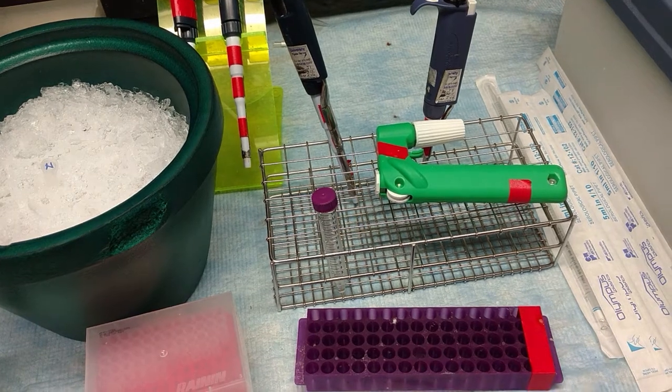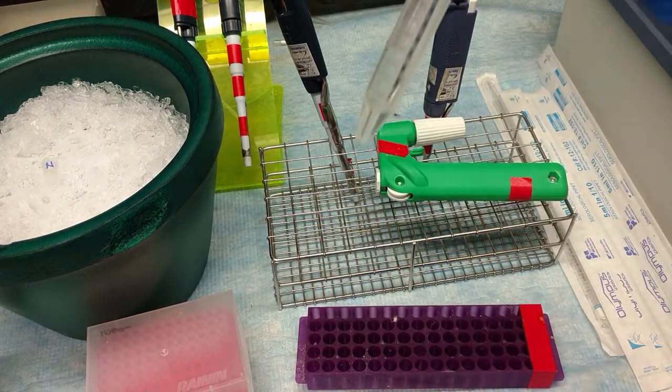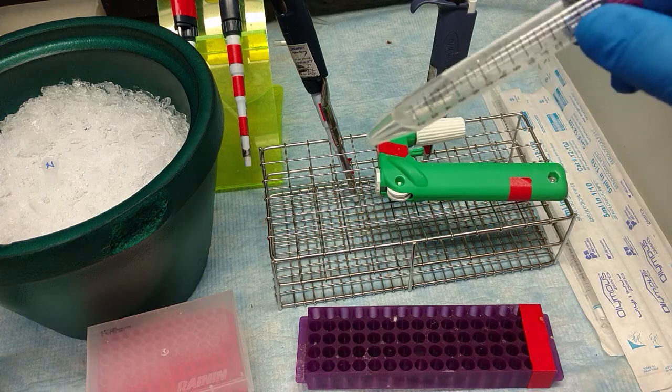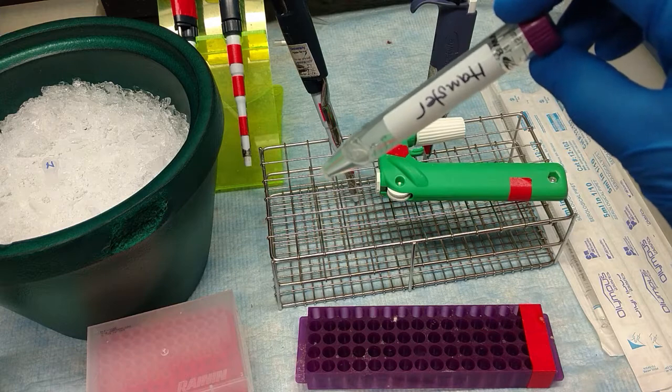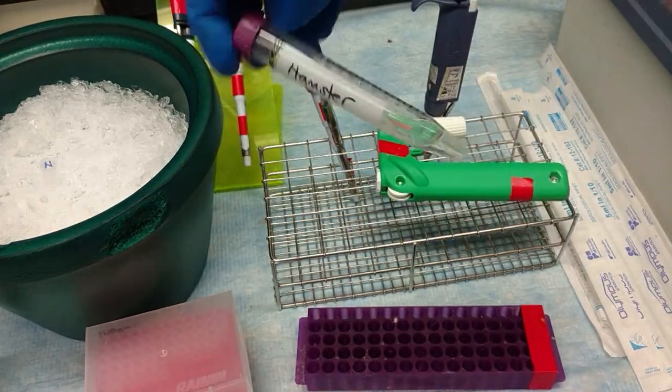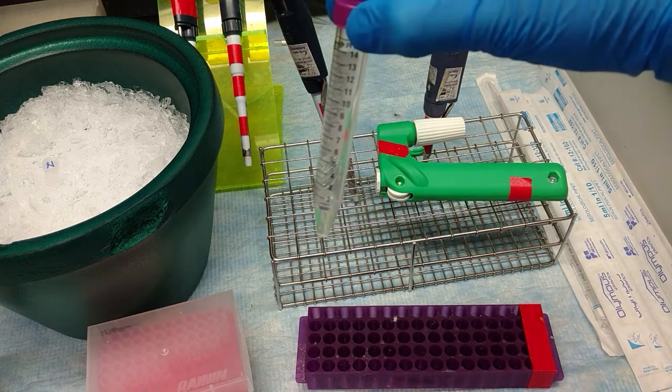What you're going to do to start this procedure is you're going to take a mil of your lysate. You're going to want lysate that's in the 10 to the 9th or higher concentration. You're going to transfer it into a 15 mil tube. Here we have lysate from a hamster.